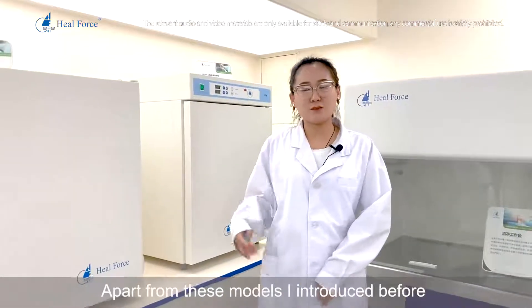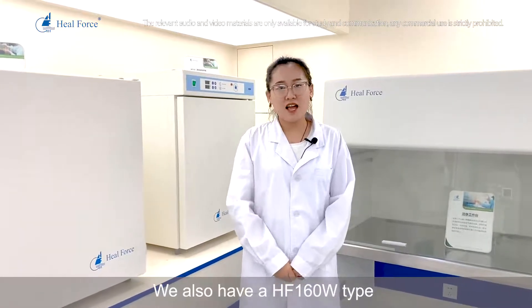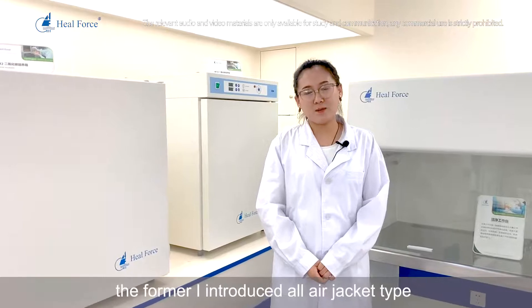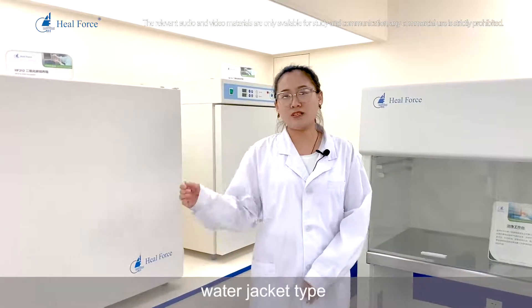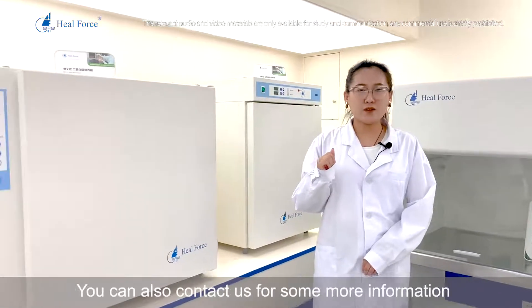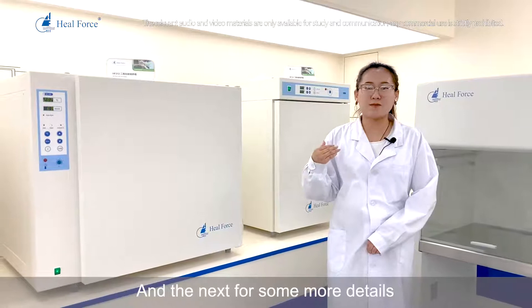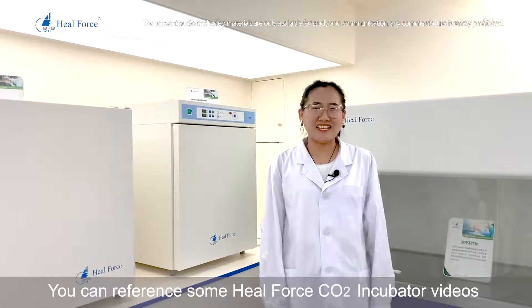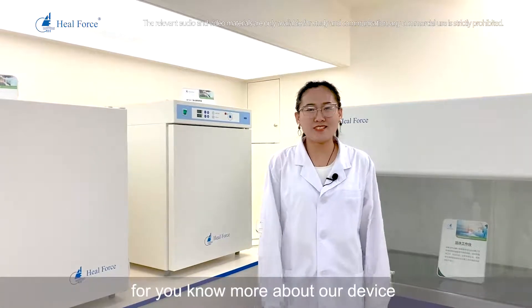Apart from these models, we also have the HF160W type, which is a water jacket model — all the previously introduced models are air jacket type. If your requirements call for a water jacket type, please contact us for more information. For more details, you can also reference our HealForce carbon dioxide incubator videos to learn more about our devices.